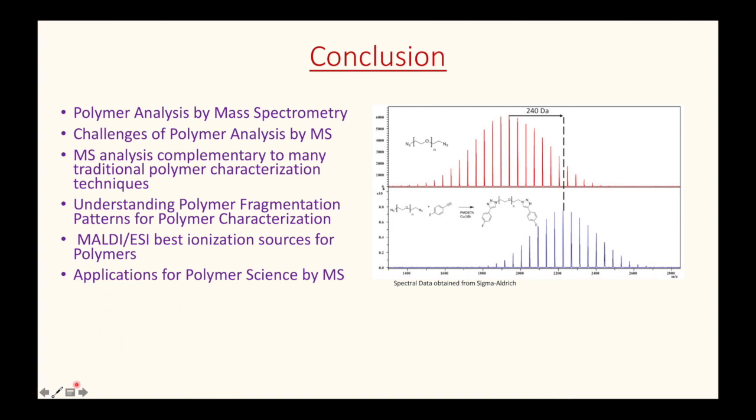One of the primary objectives of this presentation was to evaluate polymer fragmentation patterns, and there are three important things to remember. A mass spectrum for any polymer, assuming that the polymer solvent matrix is not an issue, will produce a repetitive pattern in the shape of a distribution profile.